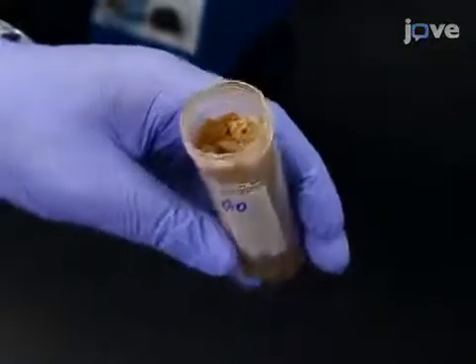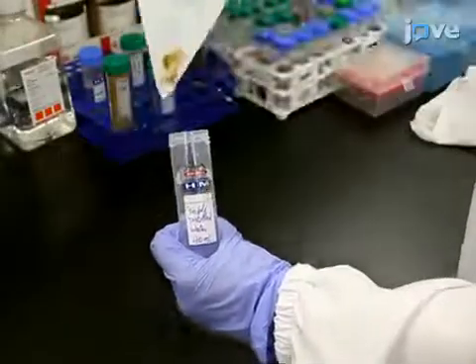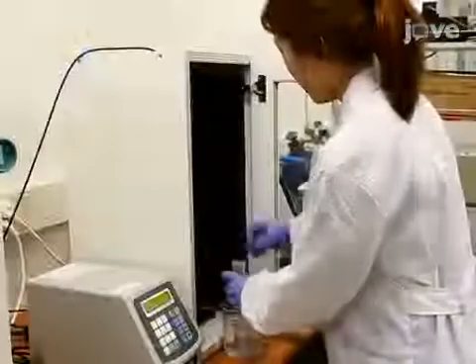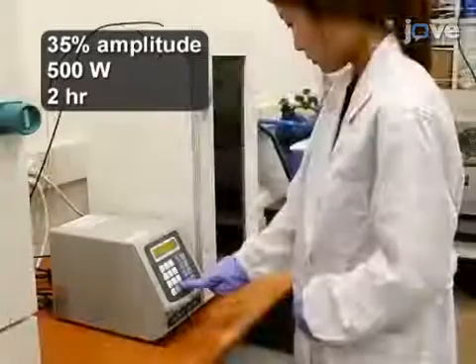Lyophilize the graphene oxide solution to produce a fluffy graphene oxide powder. To make the nano-sized graphene oxide solution, dissolve 20 milligrams of graphene oxide powder in 40 milliliters of triple-distilled water. Then, exfoliate by prolonged sonication until the entire size distribution becomes below 150 nanometers.